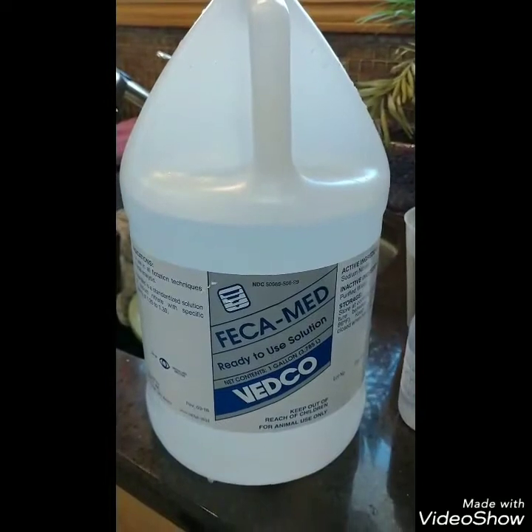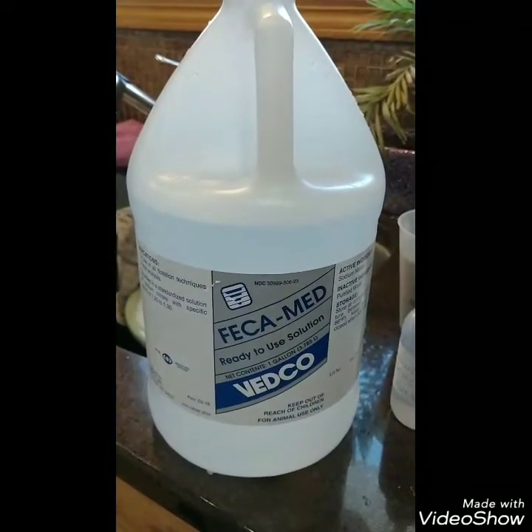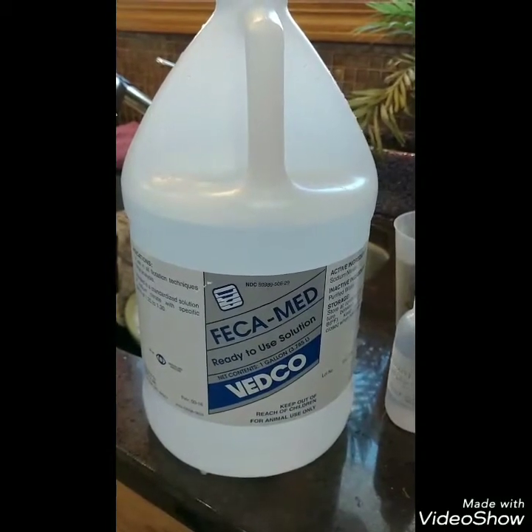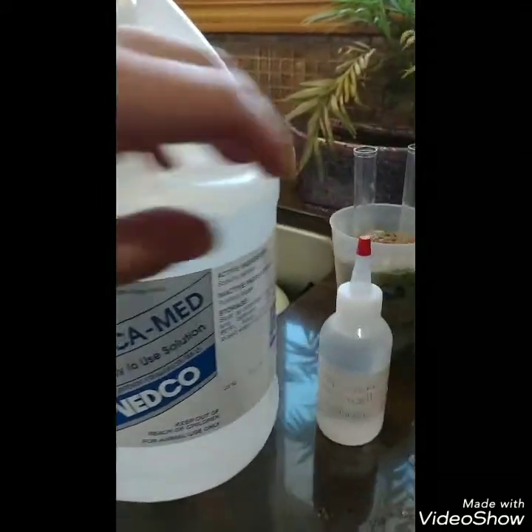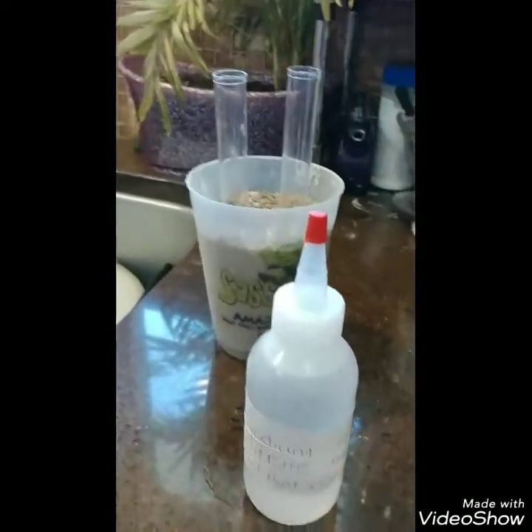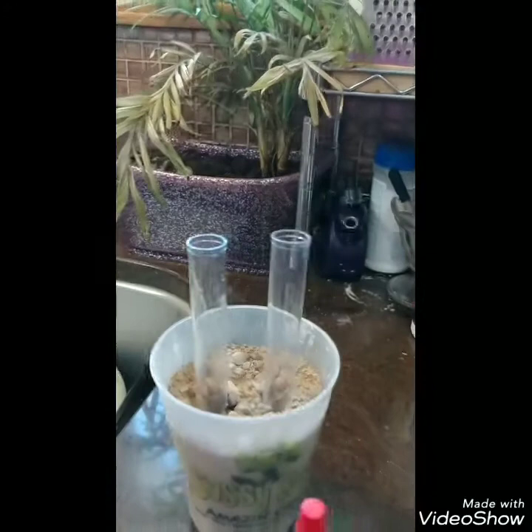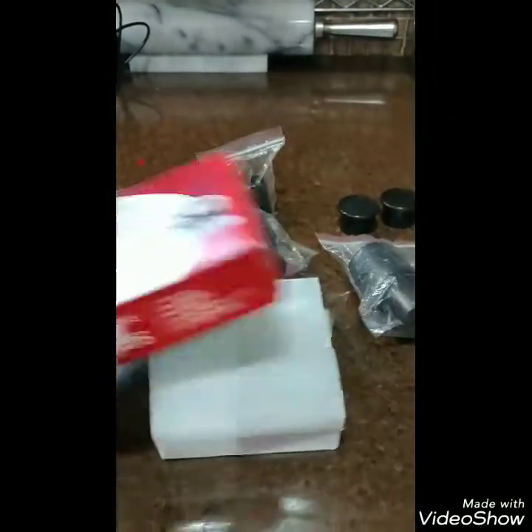This is what I ordered for the fecal float solution. If you look on Amazon you'll find it's very expensive, so I just Googled it and found a supply company that had it much cheaper. I put it in a smaller squirt bottle so I don't always have to take out my big heavy jug of it. And I have two plastic test tubes held up by sand in a cup. I have my slides and slide covers here.